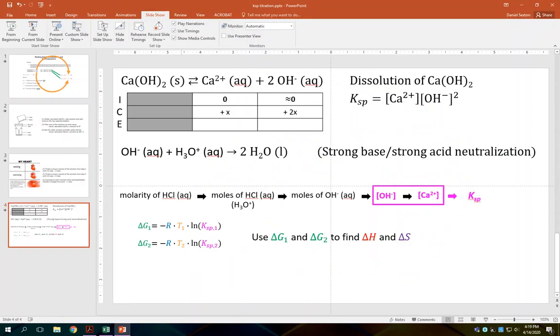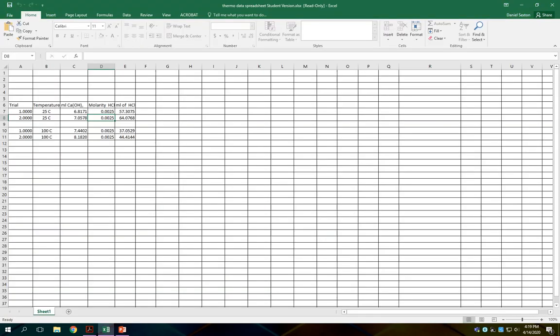Okay, so before I conclude this video, I just want to show you the data that I'll be distributing to you and specifically show you how to use it. So this is relatively straightforward. It comes in the form of an Excel spreadsheet.